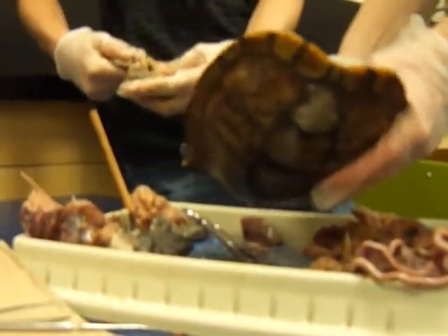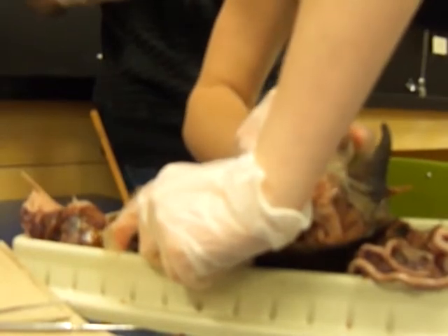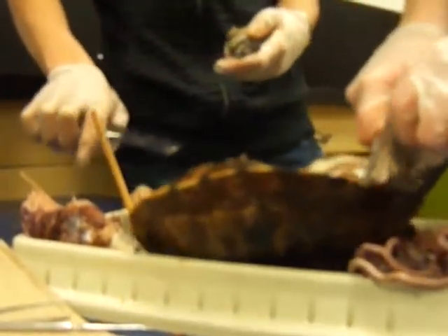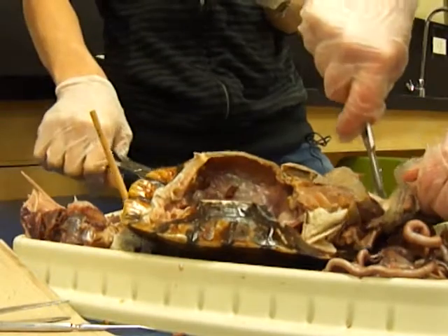Hey, that's the time. Oh, that's not coming out. Well, I've separated the leg bone from the rest of the body. Leg bone from the hip bone. Bone from the top. That would be great.